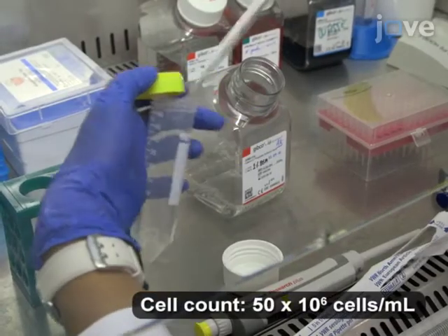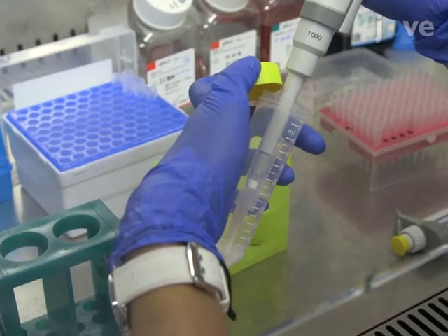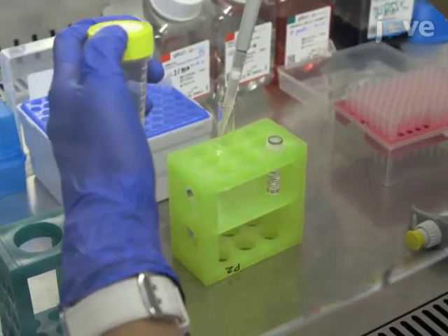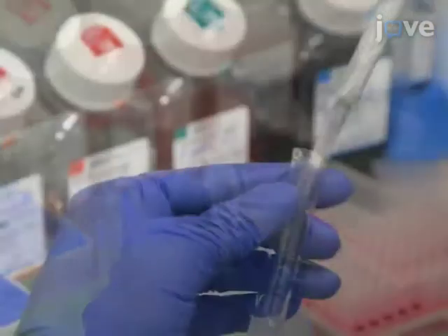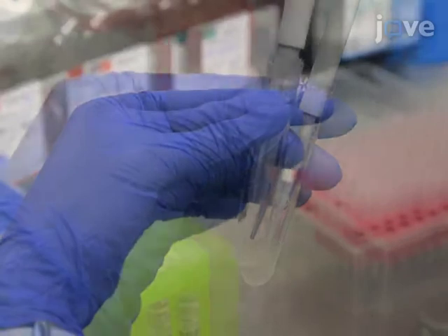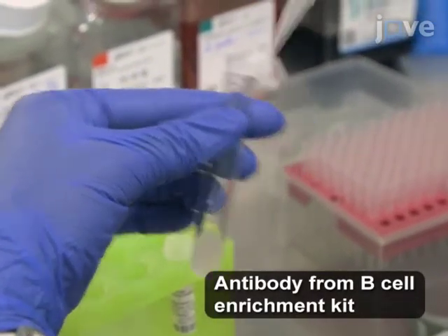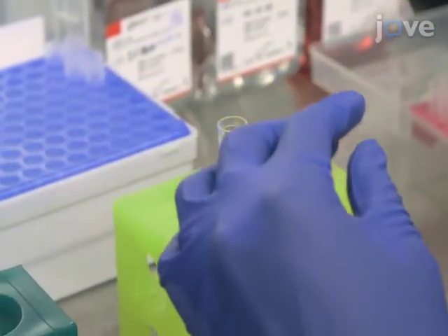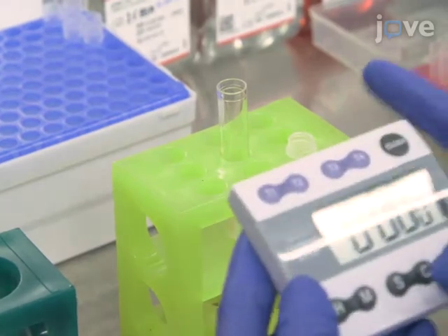Dilute the cells in phosphate-buffered saline. Then pipette the cells to a 5 milliliter polystyrene tube and add 100 microliters of antibody cocktail to the cell suspension. Pipette the cell suspension gently several times for proper mixing. Then, incubate the cells at room temperature in the laminar hood for 10 minutes.